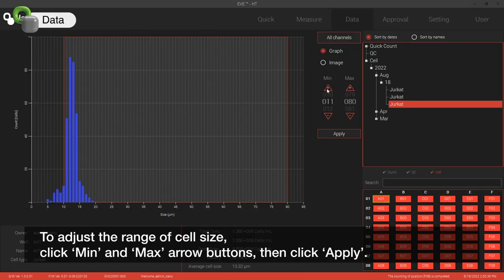To adjust the range of cell size, click Minimum and Maximum arrow buttons. Then click Apply.